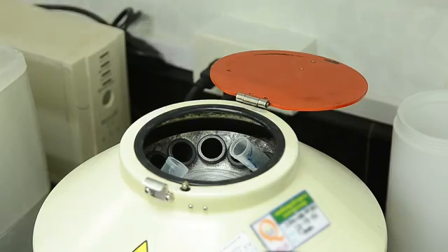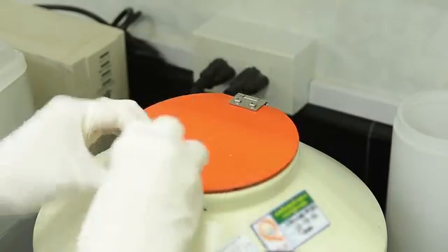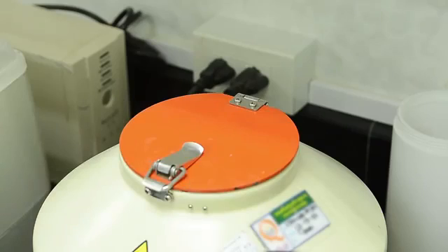Commercial centrifuges are heavy. You need electricity to power them, and they can cost thousands of dollars. In a lot of places in the world, you can't power, afford, or transport a traditional centrifuge.